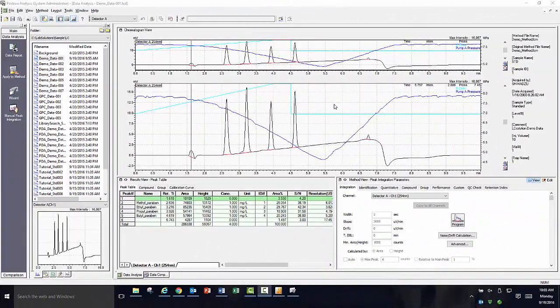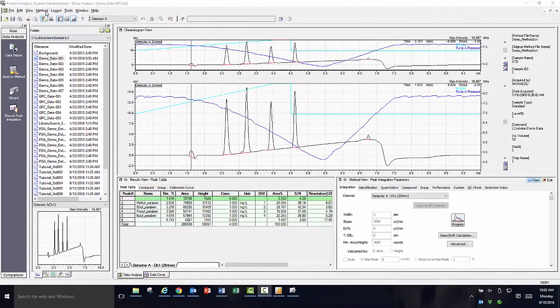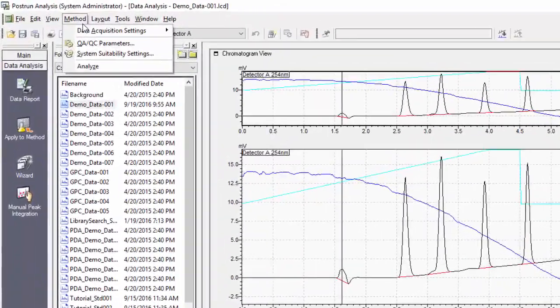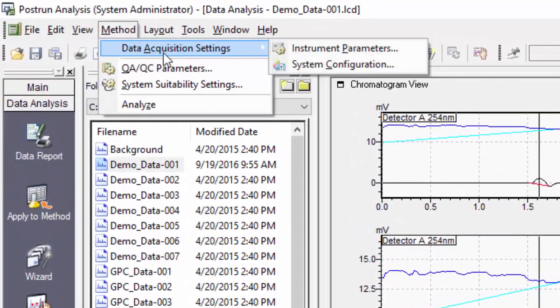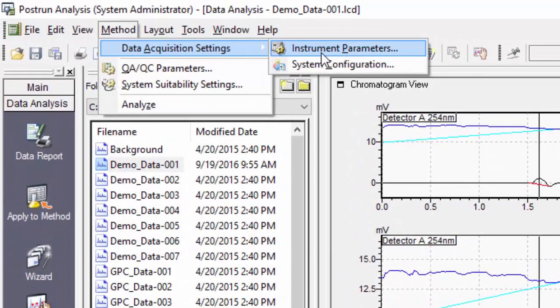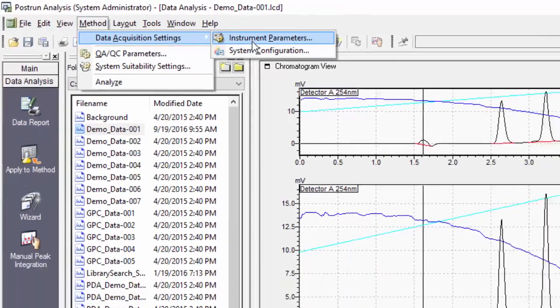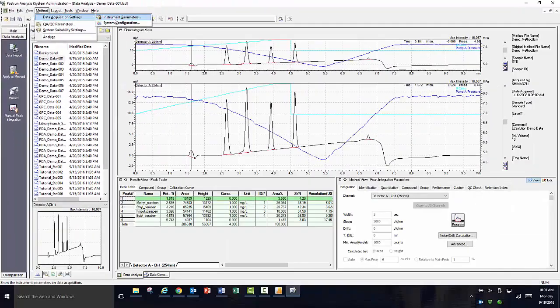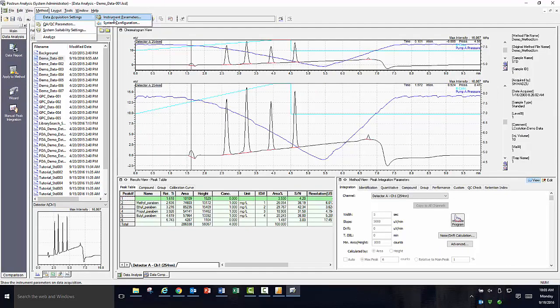In addition to being able to roll back the data, you can always look at the hardware and method conditions that were used at the time of acquisition for any data file. With the data file opened, you need to select method, data acquisition settings, then click on instrument parameters to look at the method conditions for the data file.